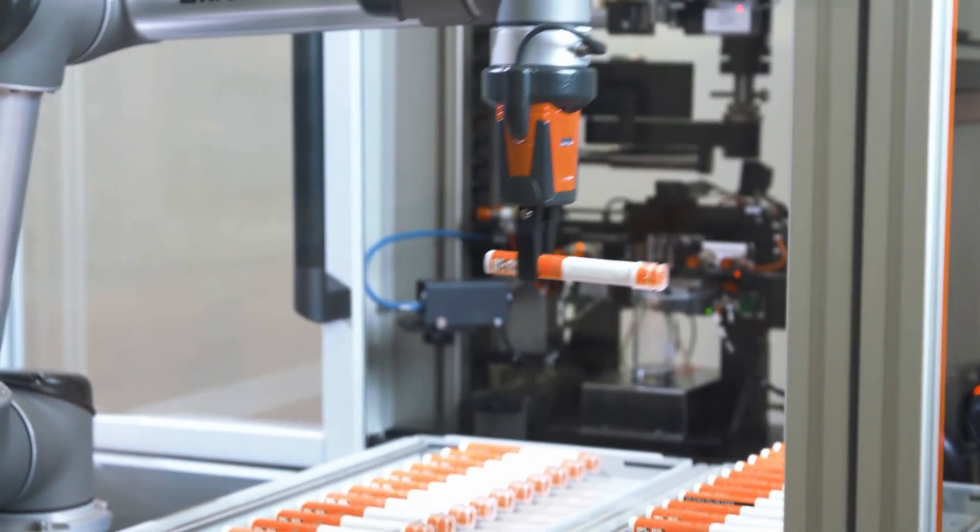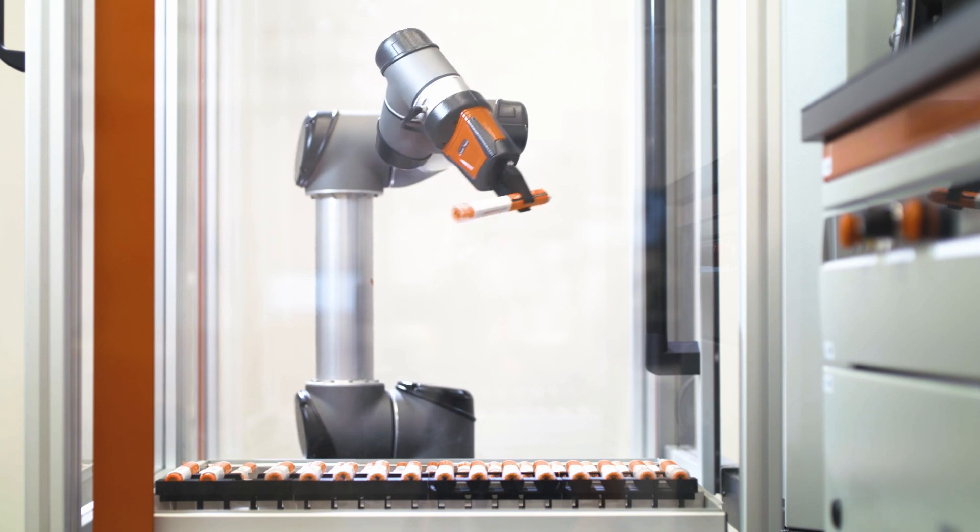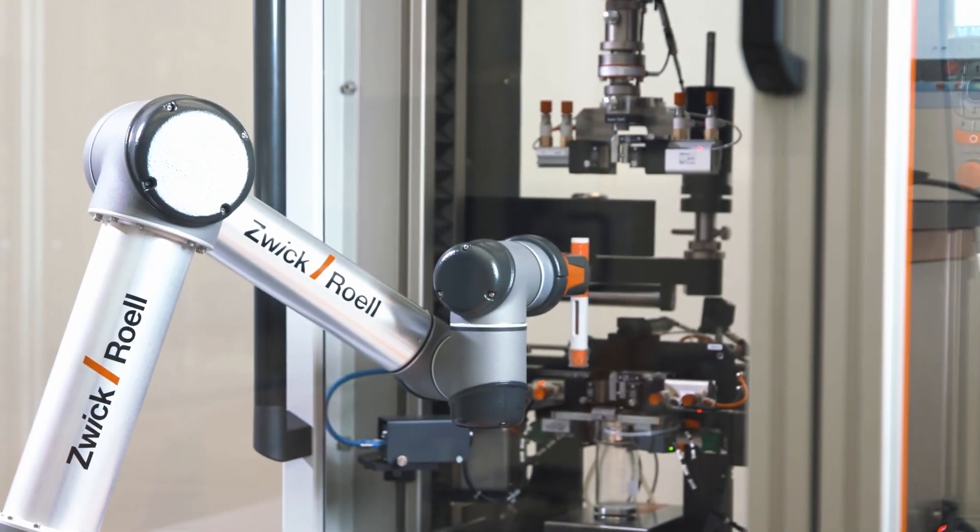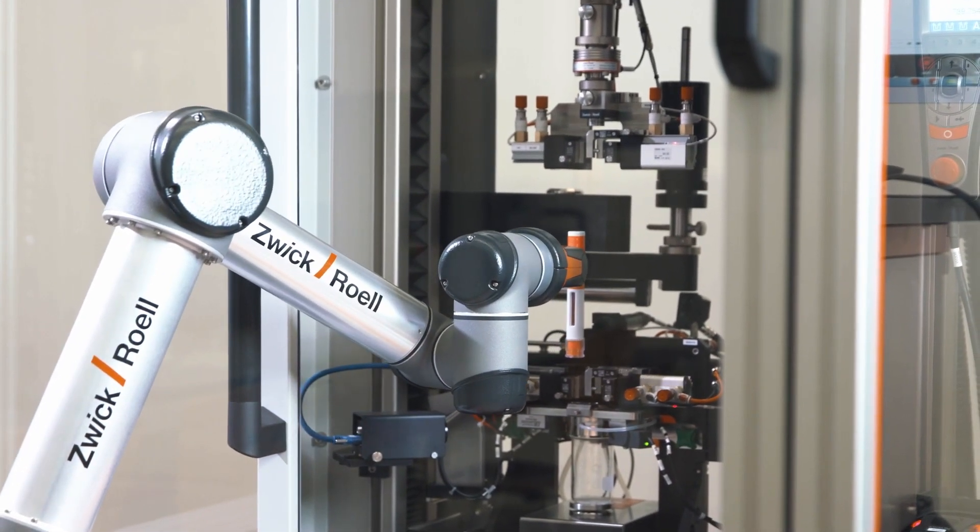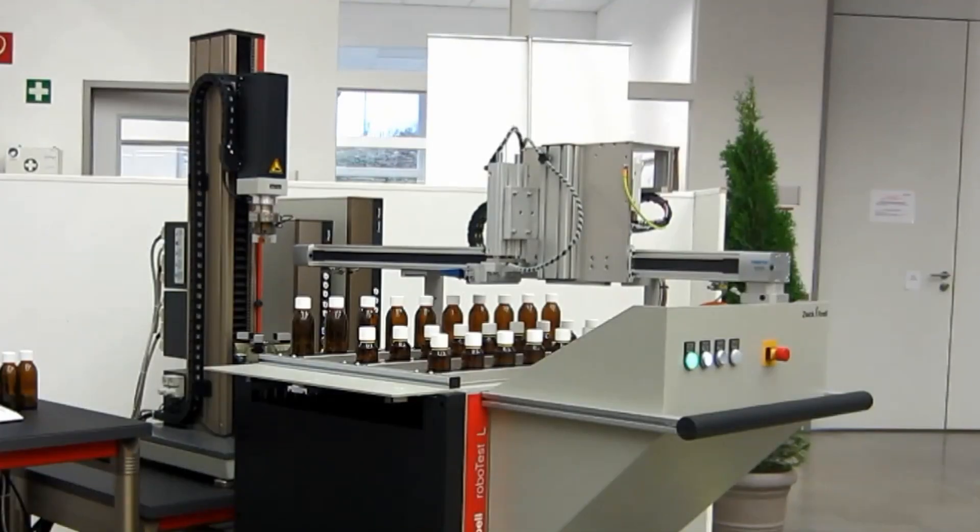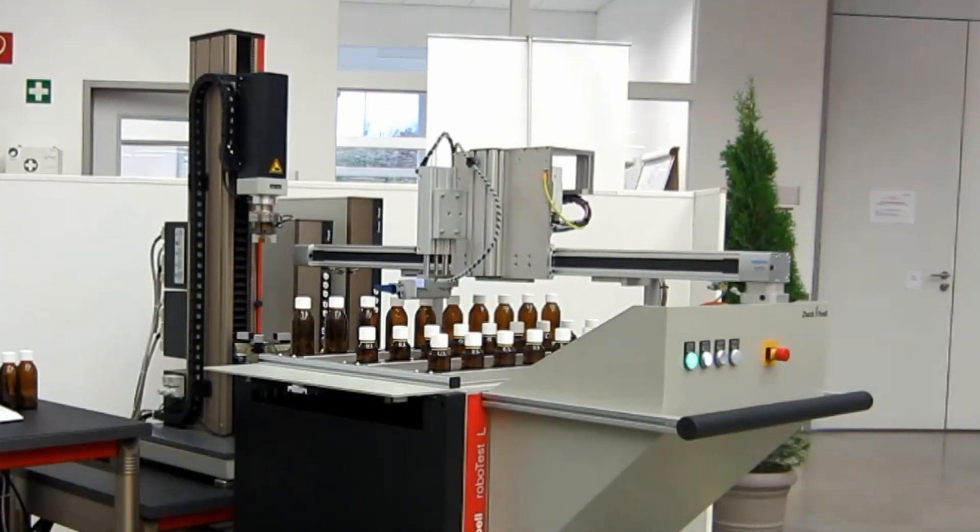Zwick Roell testing machines can easily be equipped with automated handling systems. Depending on the testing application and number of samples to be tested, samples can be handled manually or automatically.